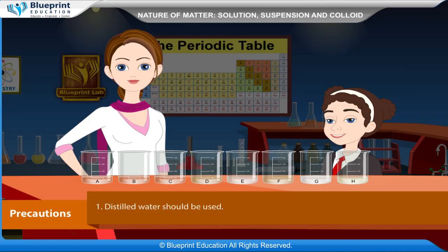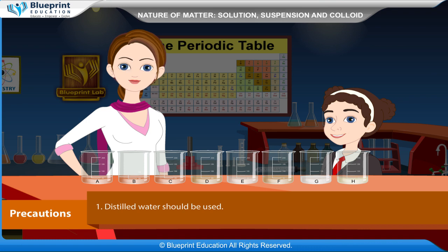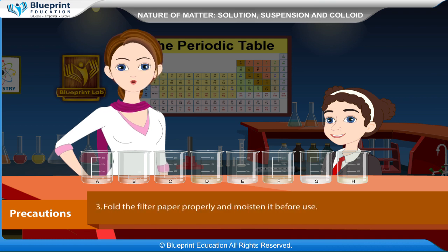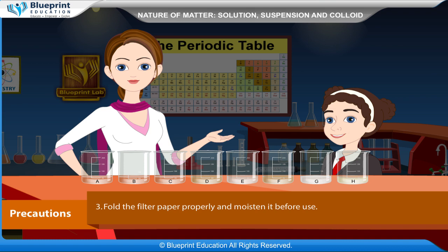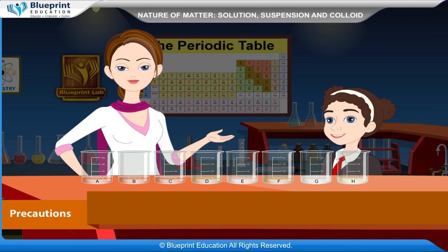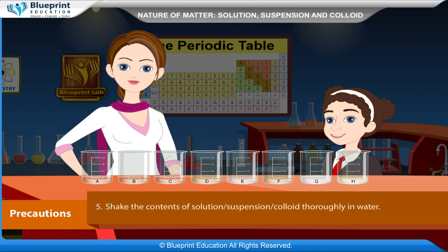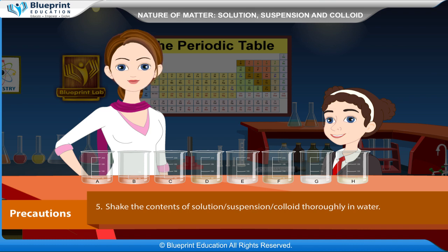Precautions: Distilled water should be used. The components should be mixed in small amounts. Fold the filter paper properly and moisten it before use. Glass rod should be clean. Shake the contents of the solution, suspension or colloid thoroughly in water.